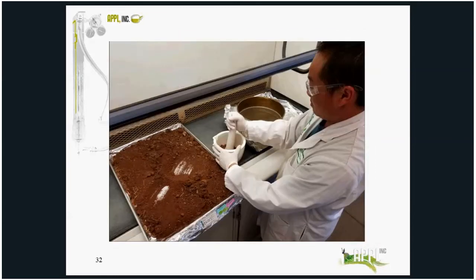This is a critical step. If the entire sample is not processed in this fashion, the efforts of the field can be jeopardized. This is also the place where it's very, very easy to take shortcuts. Manually sieving the sample takes time and effort, and mortar and pestling is a bear. So it's important that the entire sample be processed and not just the easy part.